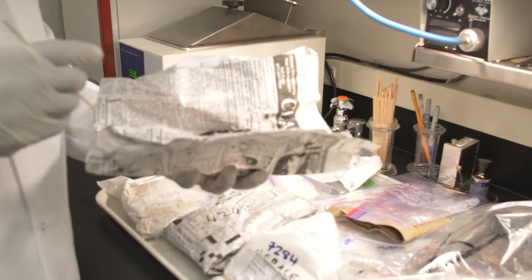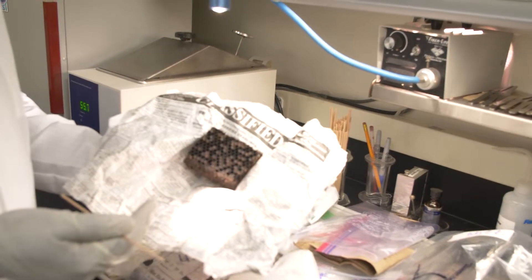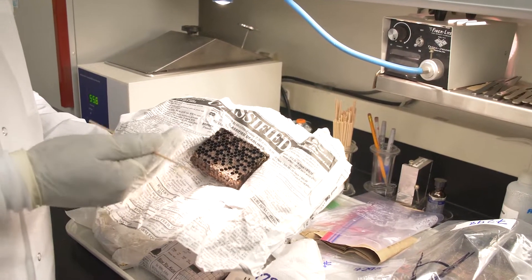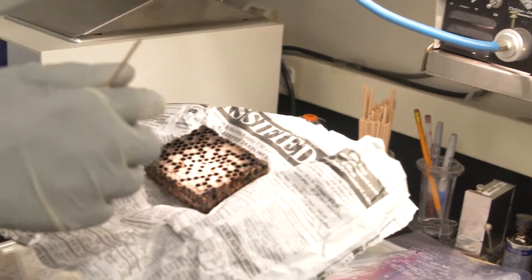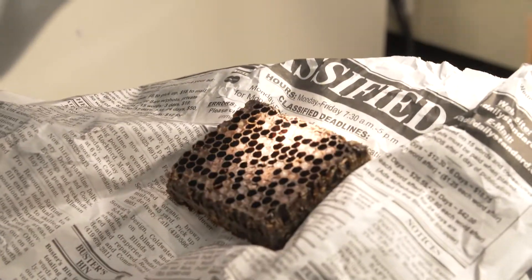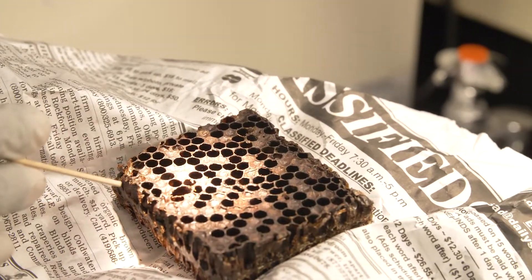What I want to do is look for signs and symptoms of disease on the comb. In this case, we have a comb we're going to try to diagnose for any brood disease. So we start looking and shine the light into the cell, trying to find brood and looking at the capping and overall brood pattern of the comb.